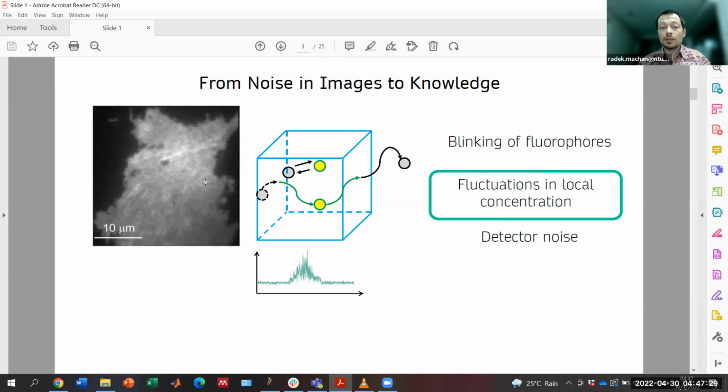So now, if we look at the signal coming from a single pixel, it will be fluorescence intensity coming from a small volume in the sample. I will later get to how that is defined. So just briefly, in this case, in the lateral dimension, it will be defined by the projected camera pixel convolved with microscope point spread function, and because this is a TIRF image, in the axial direction it would be defined by the penetration depth of the evanescent field.